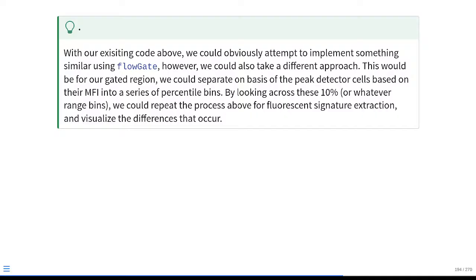It's going to be a little bit easier to do as far as getting out to the final view of the signature, but it's still not necessarily efficient when it comes to iterating through the different approaches. However, we can get a very functionally similar approach if our main question is: does a difference in the area of the positive gate retrieve different signatures?